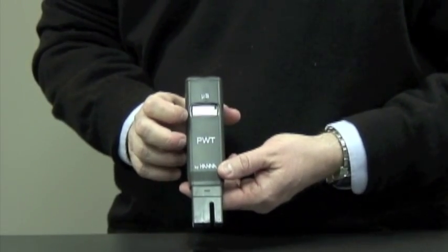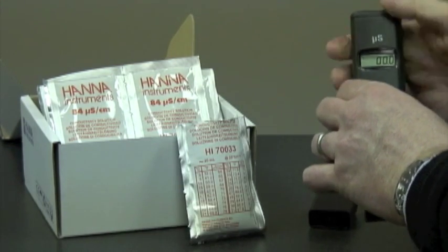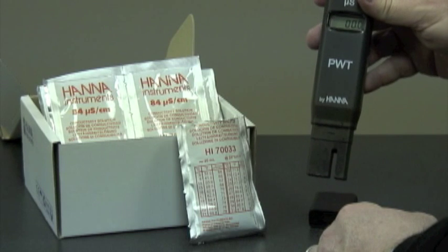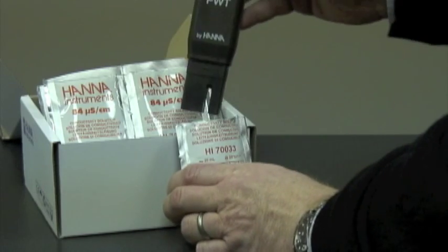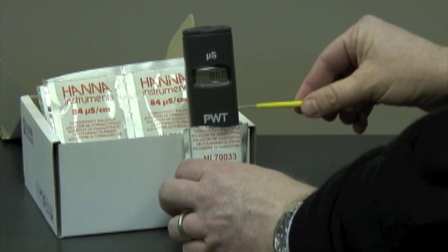Now I'd like to show you how to calibrate this unit. We're ready to calibrate. We take off the cap and turn the unit on. We're going to place it in an 84 microsiemens solution. The reason we use an 84 microsiemens solution is because we're measuring conductivity at a very low range. The reason we're using a sachet is because we're guaranteed freshness and there's no risk of decontamination.